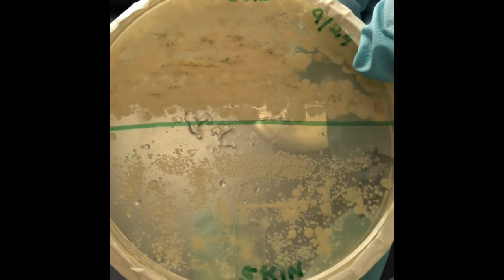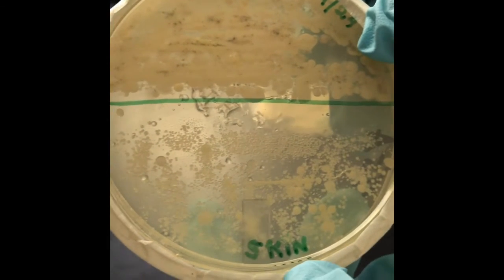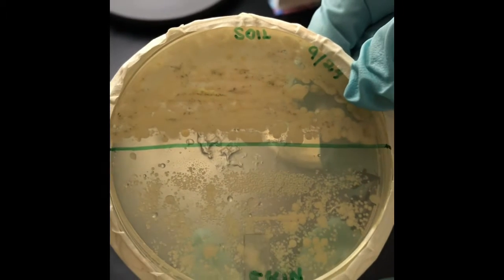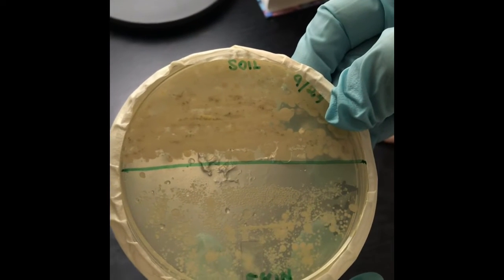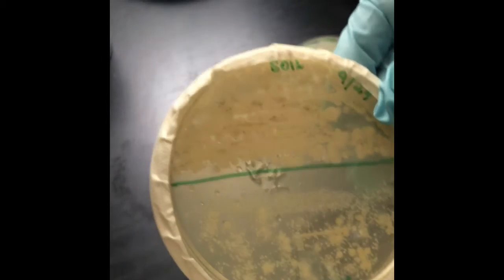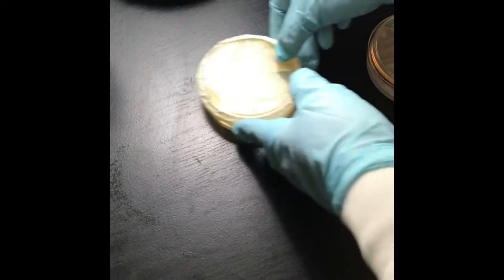I have done this to find out if Staphylococcus epidermidis is there on the skin. I will actually culture it later and find it out. And definitely Staphylococcus epidermidis should be there, I'm expecting that. Anyway, we are done with this result. Let me put it there.